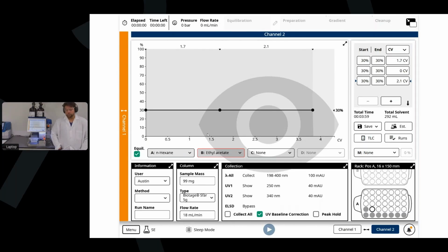I also, personally, like to use methanol. It's a fairly weak solvent compared to acetonitrile, and you don't get a huge UV peak at the front of the purification. But it will depend on what kind of resolution you're seeing. DMSO is going to give you the best resolution between peaks because it is more polar compared to something like methanol. So hopefully that answers your question.